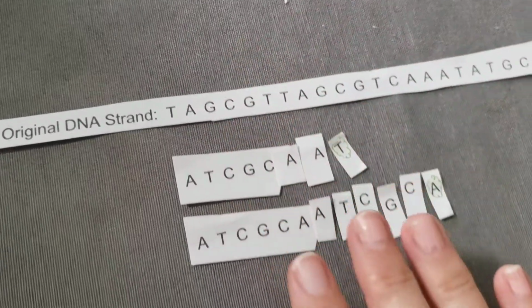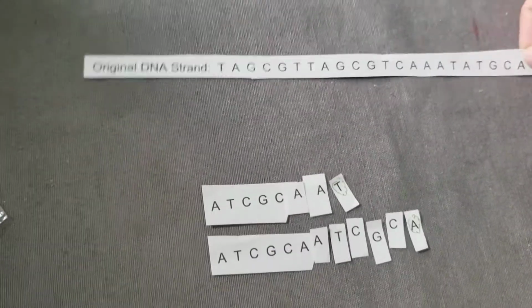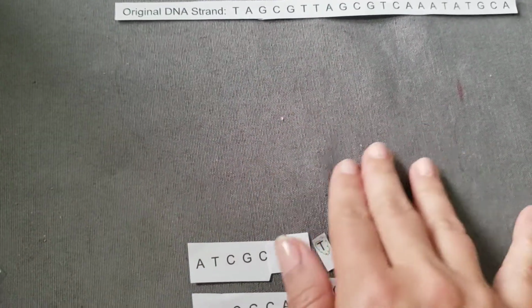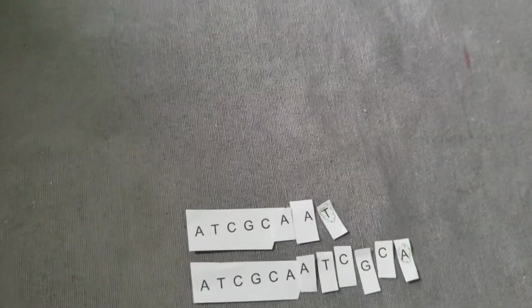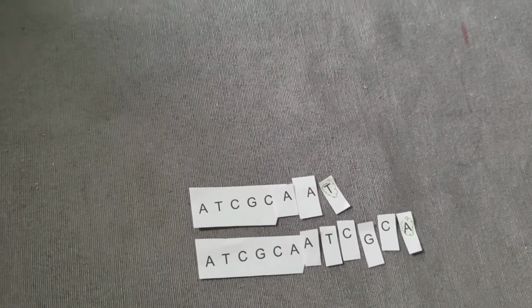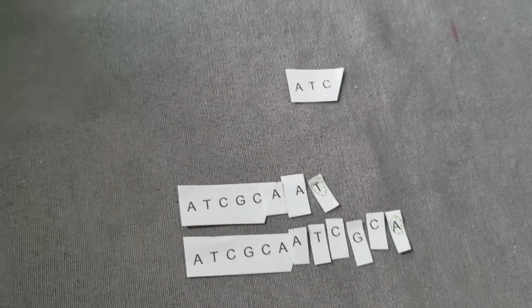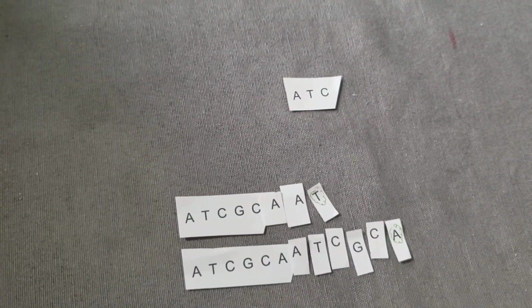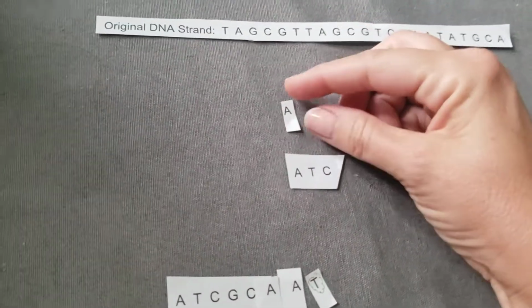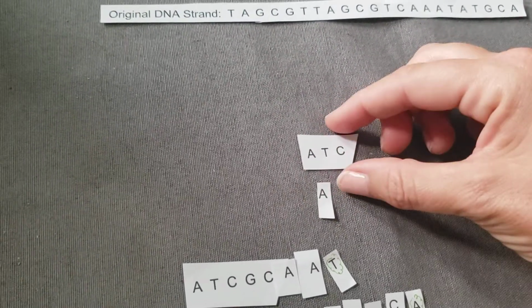Now you put all of this into a gel electrophoresis, more or less. It's a machine that's going to do the exact same thing. And what happens in a gel, if you recall from previous learning, is the DNA will move through a gel lattice structure, but the smallest fragments always move faster. They don't get stuck as much in the gel. So if you have a fragment that is very little, let's say that little, that might come through early on in the gel electrophoresis. In fact, the one that's going to come through first is the one that's just one single nucleotide long. So our A comes through first. If it's fluorescent, it will be read by the laser.